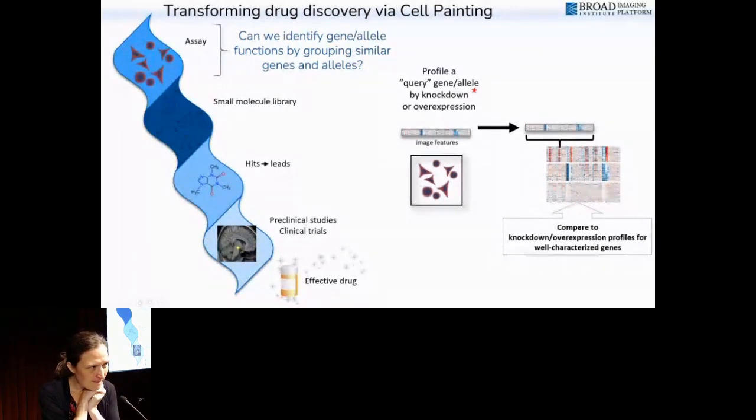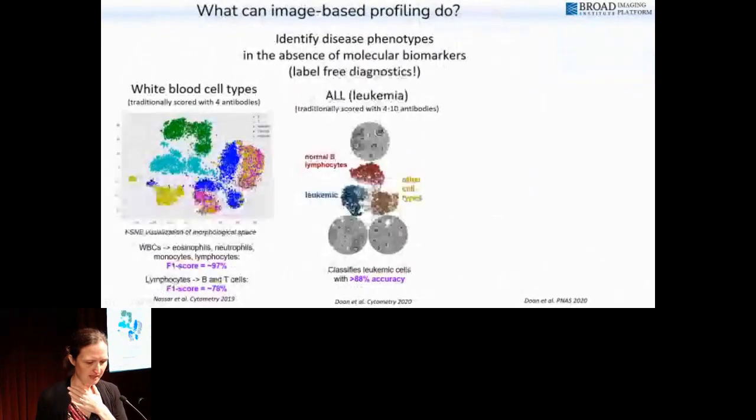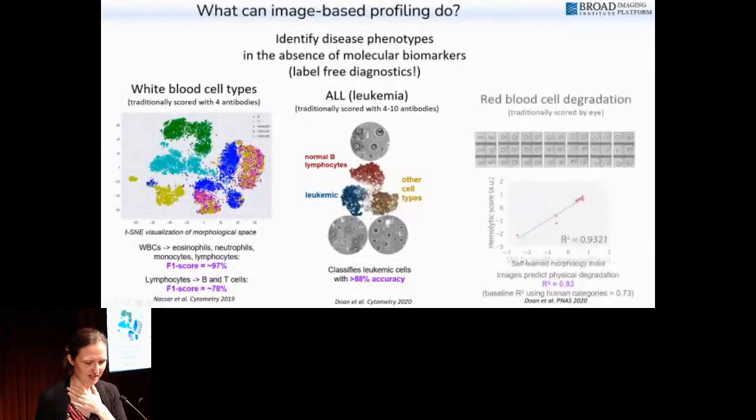All right. Very basic question. What's bright field? Oh, what is bright field? Bright field is just when you shine light on cells and snap their picture. These are examples shown here. They are black and white images, but they're not like the fluorescence images that have the black background and then some color on top. Instead, it's just these, and here are a few more examples. It's just like plain light images.